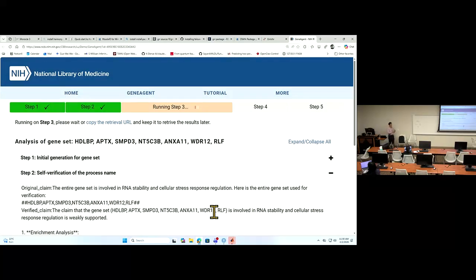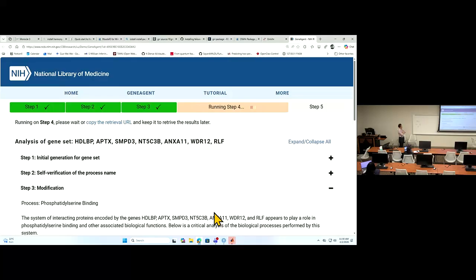So all you have to do is get your results using DVDE, get a list of genes, and paste them into that table. You can certainly use this web interface directly, but sometimes you forget where the link is, so you can go through the MATLAB interface to achieve the goal. So you have to wait. It will generate a report with a very thorough analysis of the function of those sets of genes.